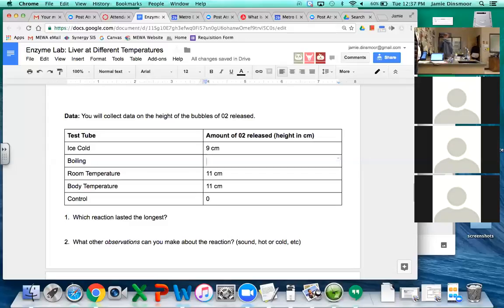We have a blanket in here. You're going to use a blanket? I think it's like a fire blanket or something. I don't really know what this is. Like a mat. It's a blanket. Oh, look at this guy, it's coming out of the tube now. Hold on. Actually, this might not work. You guys, if people ever tell you that you can't do science with no supplies, tell them they are wrong.